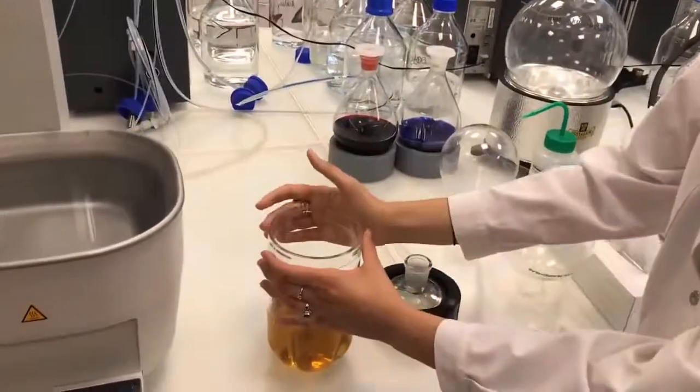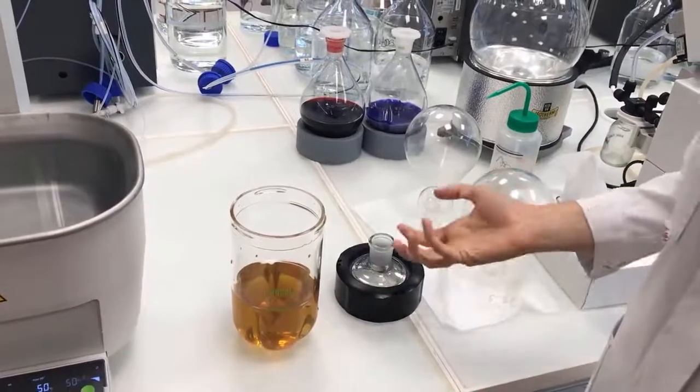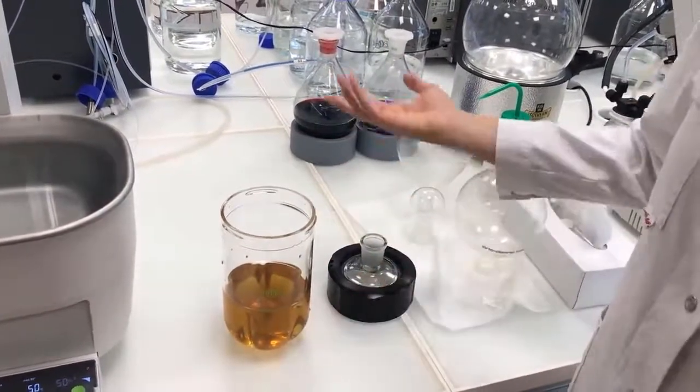As you can see, I have my flask here in which I have my sample. The sample is peppermint tea, so it's water and the tea.